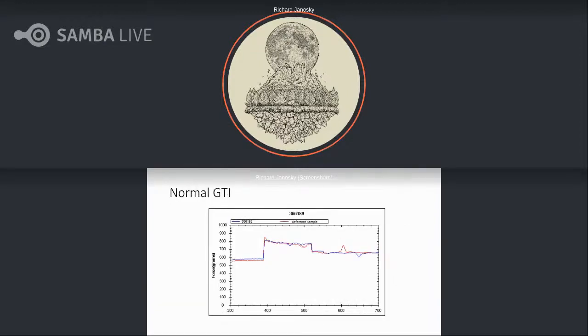Next, we're going to run through just a couple of graphs to show you what the image from the analyzer is. Here you have the grams of force that is graphed to extrude the sample. And the blue line is our sample. The red line is always going to be your reference sample. And here we see these two greases almost identically match up. So this is an almost perfect response from the used grease compared to the reference grease that's going in. So we know that this grease is performing over the step changes we see here in the exact same manner.